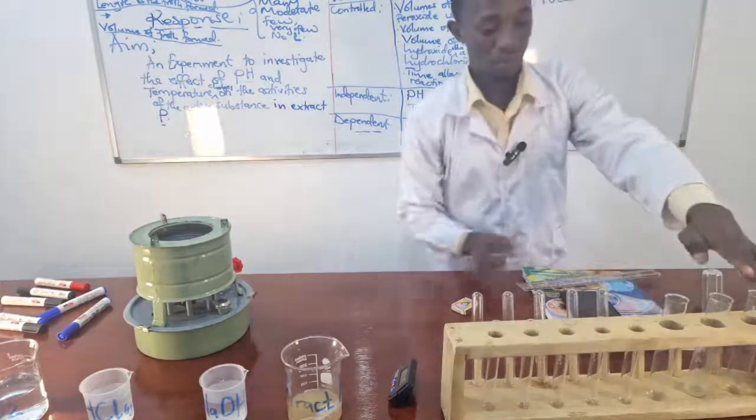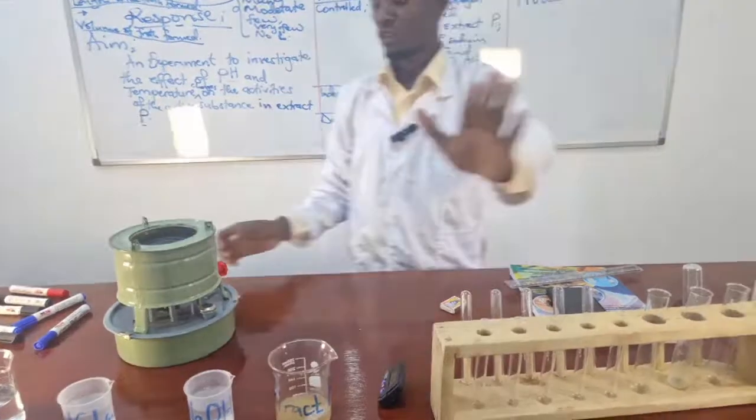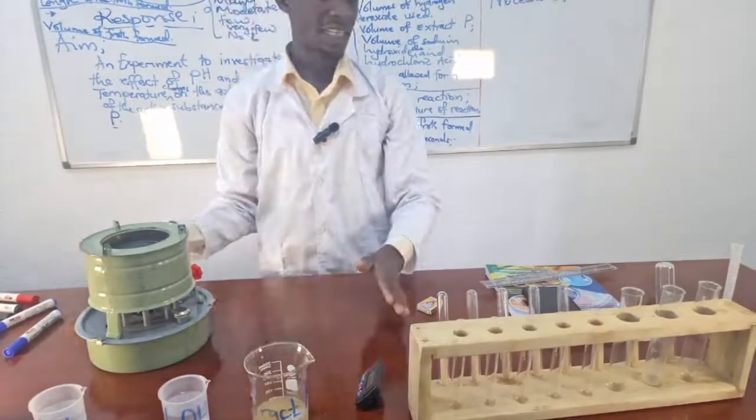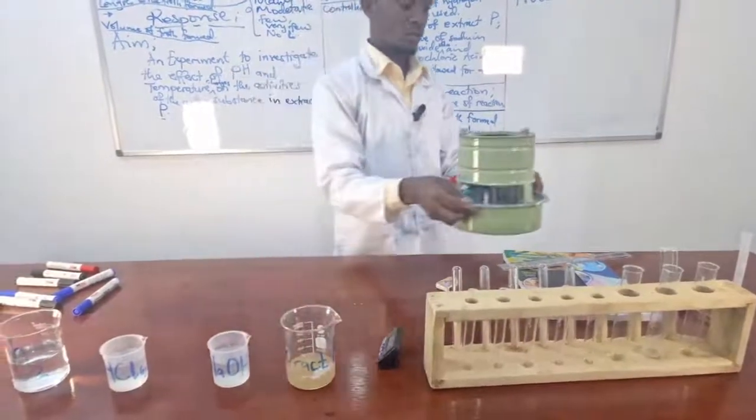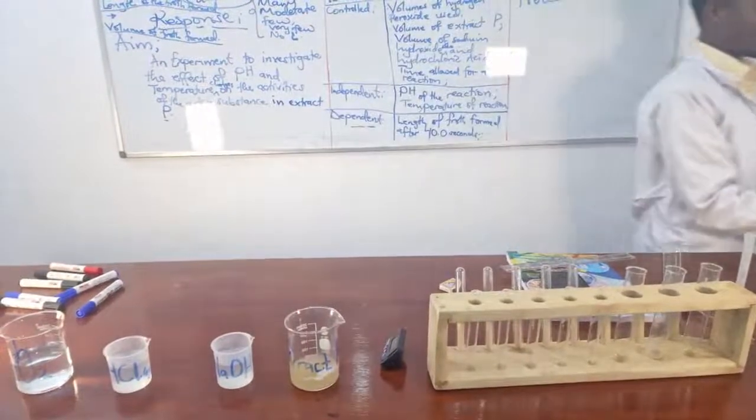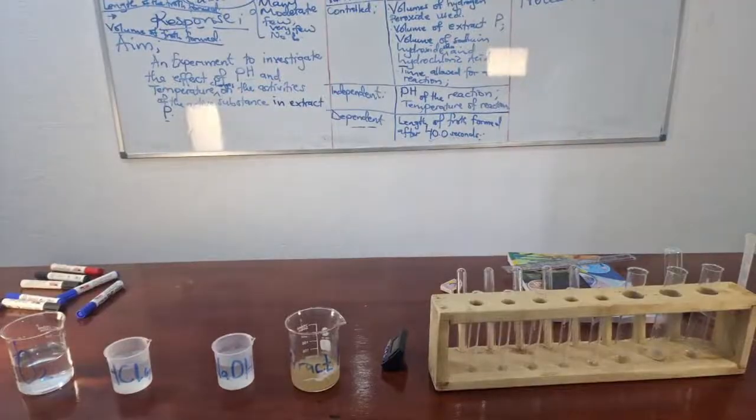So I've boiled the sample, that is our sample. I started with boiling such that I can let the boiled sample cool, as you share your expected observations, your expected procedures.